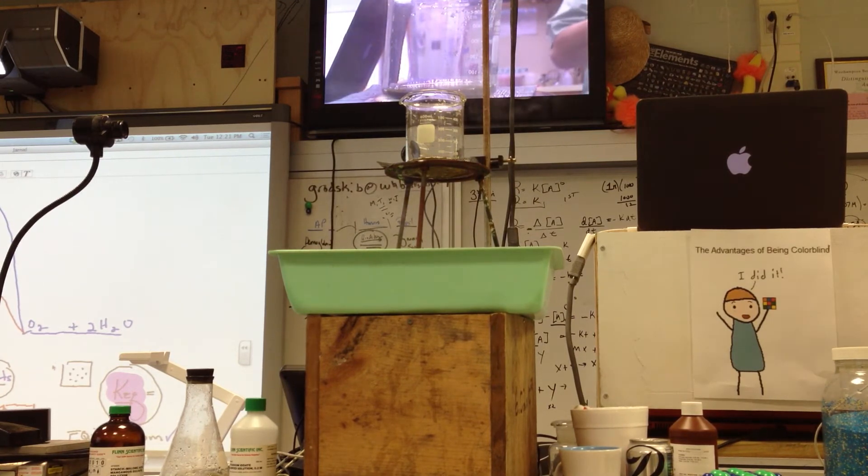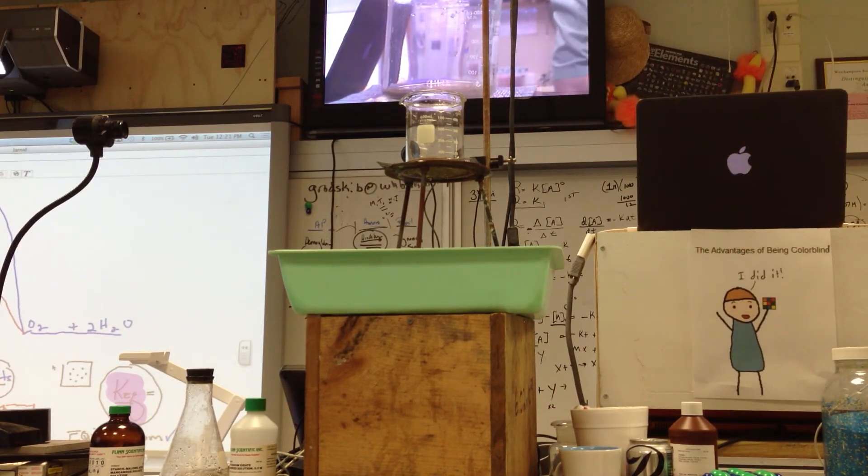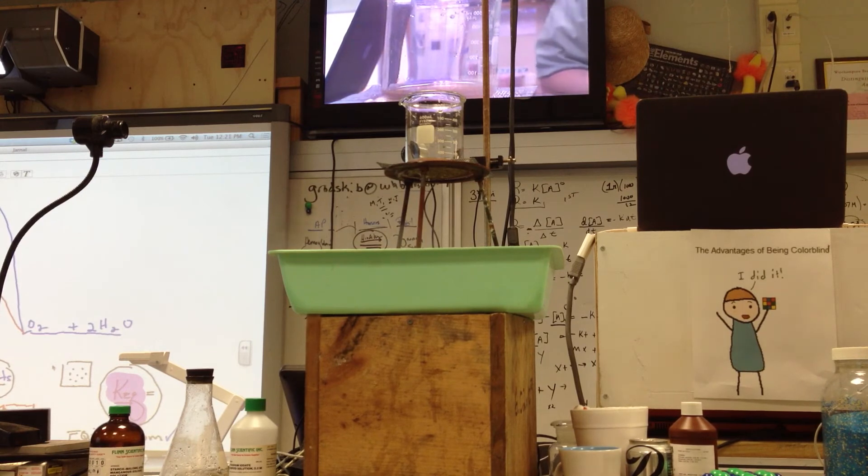Yeah, so you have an exothermic reaction, started high, right? Went a little lower. And if that's truly a catalyst, did it get reformed at the end? No. Yeah, it was. There's some color. Yeah, it would be.